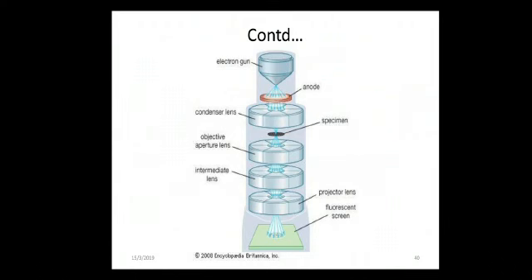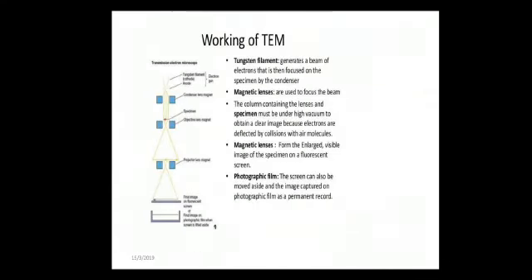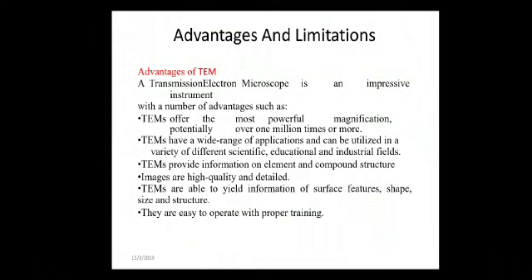Again, we have some disadvantages in TEM. TEM, meaning transmission electron microscopes, are very large and very expensive, and sample preparation is laborious. Yes, sample preparation is very complex.